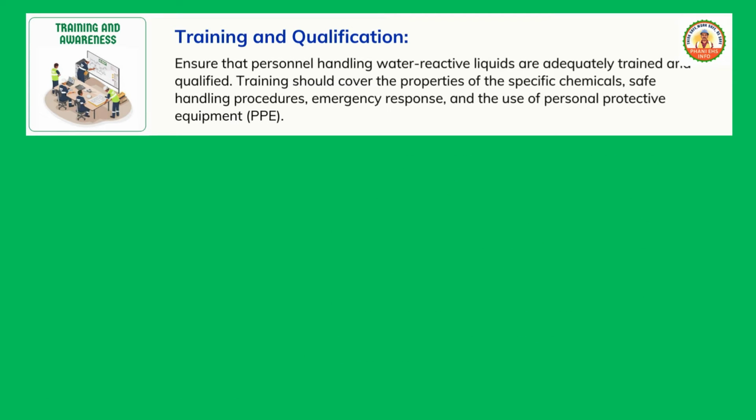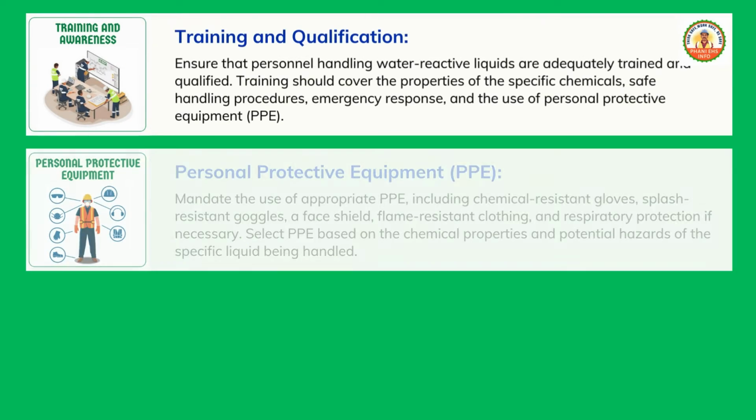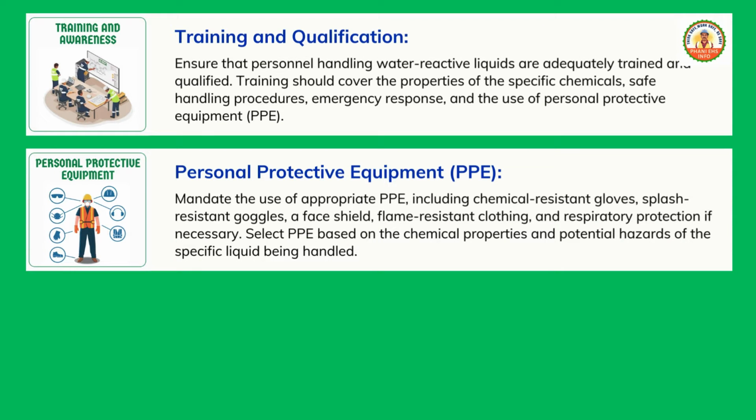Training and qualification. Ensure that personnel handling water-reactive liquids are adequately trained and qualified. Training should cover the properties of the specific chemicals, safe handling procedures, emergency response, and the use of personal protective equipment, PPE.